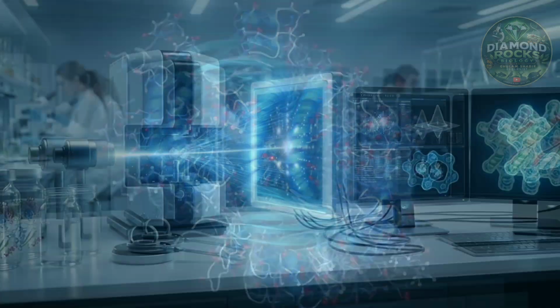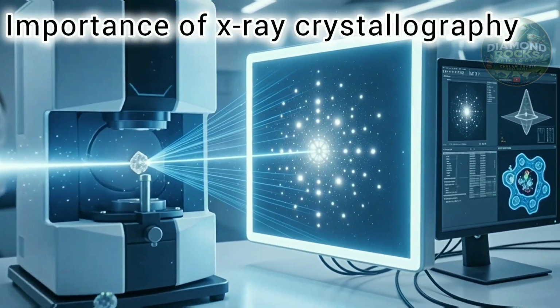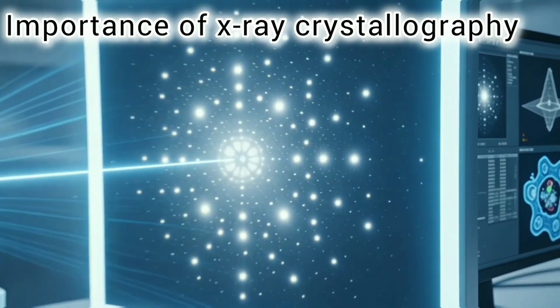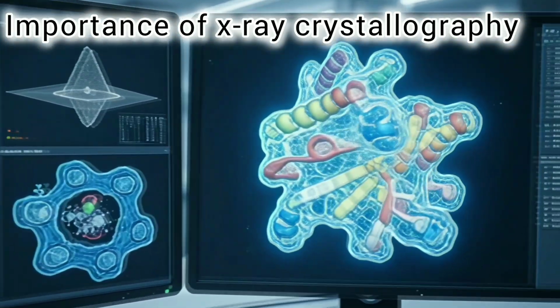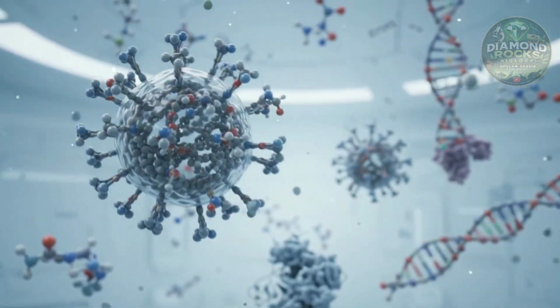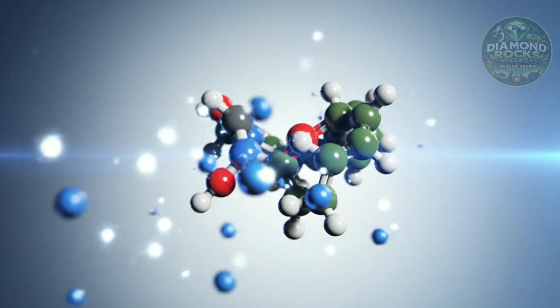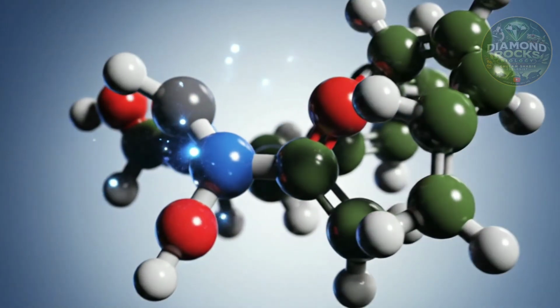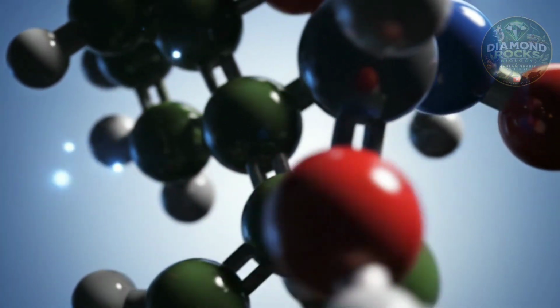Importance of X-ray crystallography in biology. X-ray crystallography has helped scientists understand the structures of important biological molecules, including DNA, proteins, enzymes, viruses, and other biological complexes. Understanding molecular structure helps explain how molecules function and can assist in drug development.